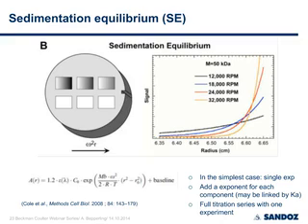Here, for example, if you have an A plus B goes to AB system, here at the meniscus, you have the lower concentration, so you have more free A, more free B, and less complex, while at the higher concentrations, at the bottom of the cell, of course, you have less free A, less free B, and more of the AB complex. So each point of those concentration series corresponds to a single titration point.